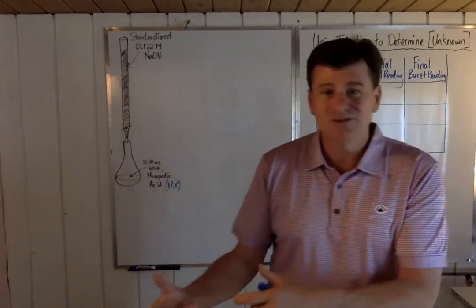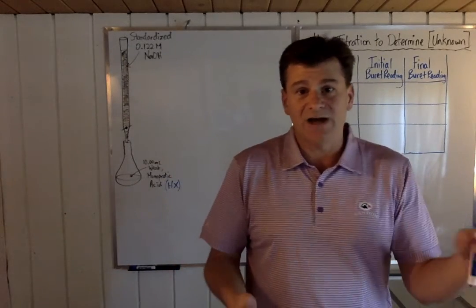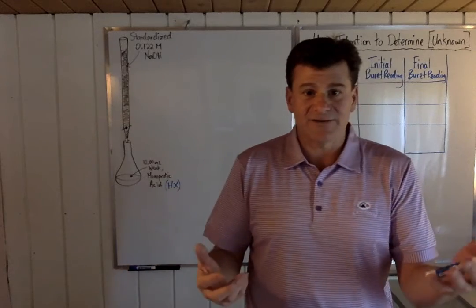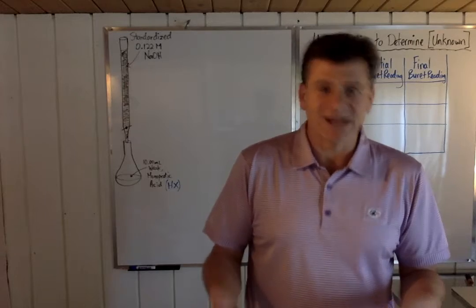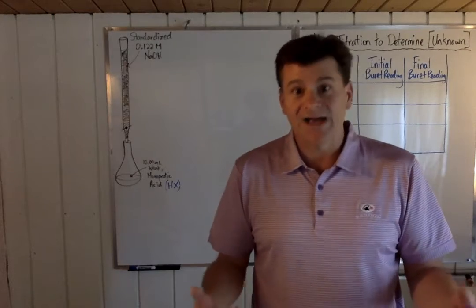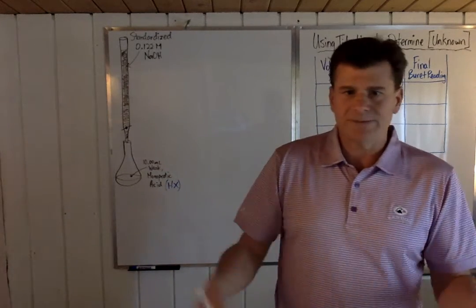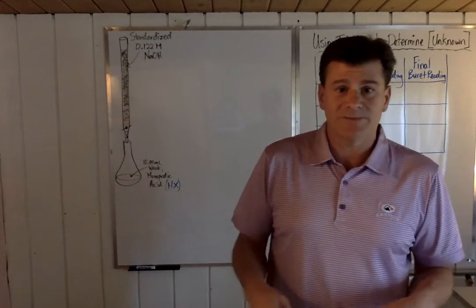You actually have to make a solution of sodium hydroxide as close as you possibly can, but then you have to make a standard solution of an acid that is non-hygroscopic, and then you have to titrate the sodium hydroxide against the standard acid solution you made to determine the value for the sodium hydroxide. So it's kind of interesting that you use sodium hydroxide all the time, but you have to standardize it first using a standard acid solution. You'll see this in your high school labs or in whatever labs you're going to do. The first step is always to make a standard acid solution that you standardize your sodium hydroxide with.